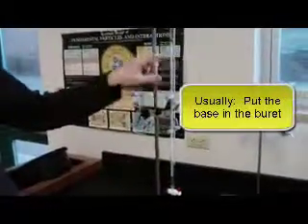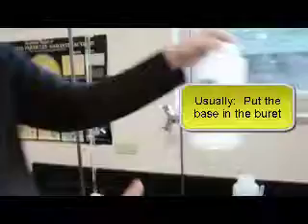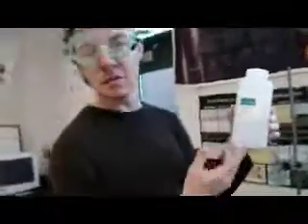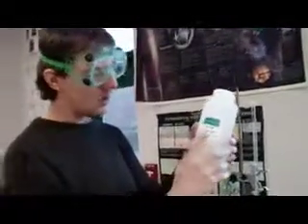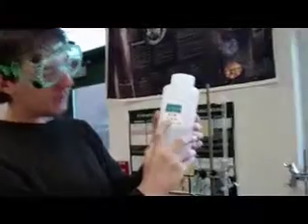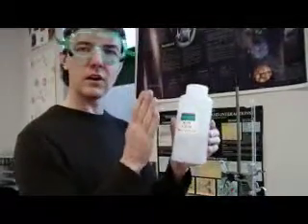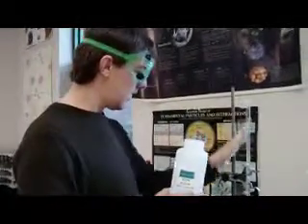Now, when we do titrations, typically, not always, but typically what you'll be doing in this class at least, your base is going to go into the burette. Okay, base, burette. Now for today's titration, I'm going to use potassium hydroxide. The reason I'm going to use potassium hydroxide is that's the first thing I saw that was a base that was already made up. I saw some sodium, but it was empty. So we're going to use potassium hydroxide. This potassium hydroxide is 0.20 molar. So this is our standard solution. We know the concentration of this solution. So our standard base solution is going to go into our burette.